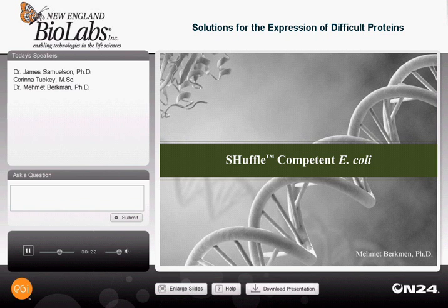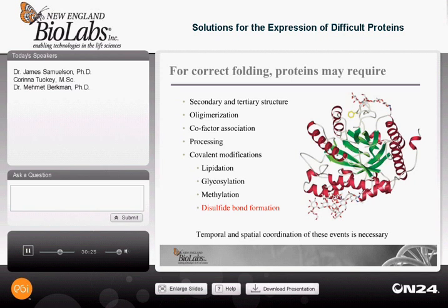The story of protein folding doesn't stop after its synthesis. There are many proteins that require covalent post-translational modifications. This could be proteolytic cleavage of their prodomain for certain secreted proteins, or covalent modifications which attach sugars, methyl groups, fatty acids, or in the case that we're going to talk about today, certain proteins may form disulfide bonds. I'd like to remind everyone that these events in a living cell are highly regulated both in space and in time.